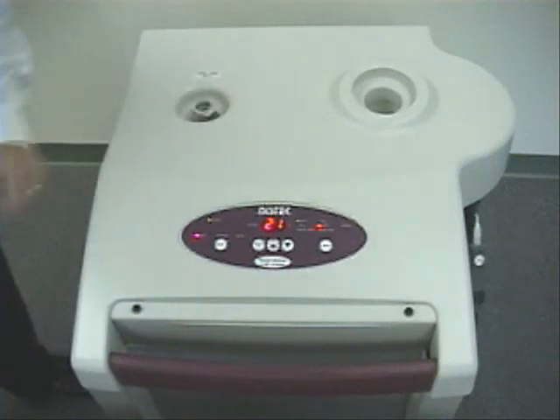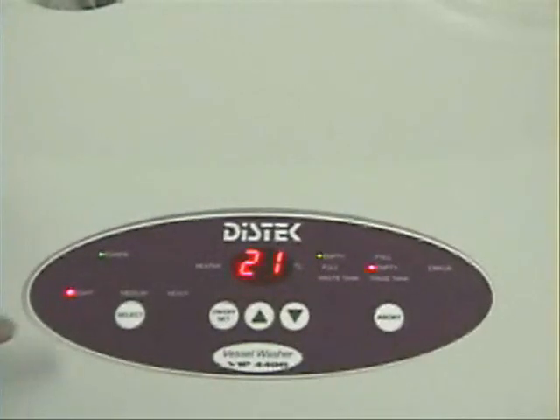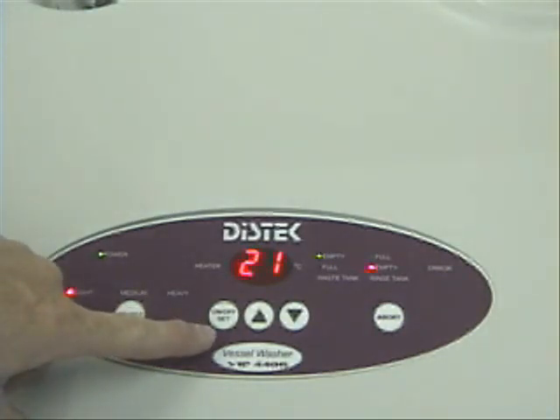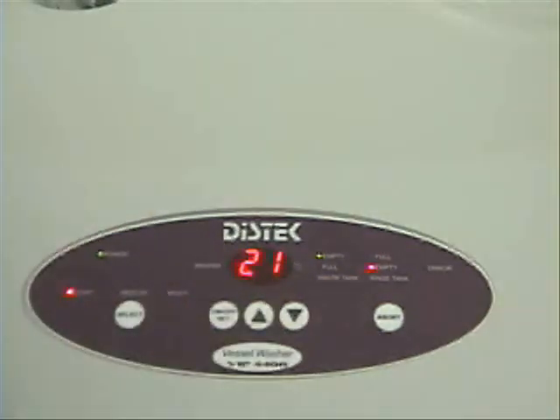This is the cradle for the universal wash nozzle. And here at the user interface, the chemist will select the appropriate wash cycle, set the temperature of the rinse media, and monitor the levels of the waste and rinse tanks.